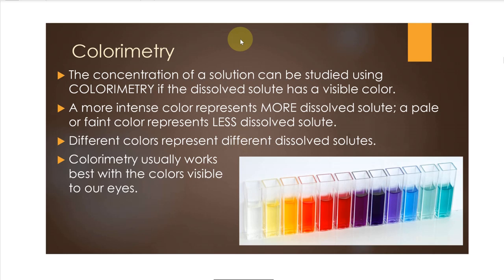Well, the same thing applies here in chemistry to how much solute, which is simply the part that's dissolved into a solution. So how much solute you've added to the solvent. Usually we're talking about water as our solvent. So in this case, the more solute you've added, the darker the color will get, the more intense the color will get. That only works, again, if the particular salt gives a color at all.